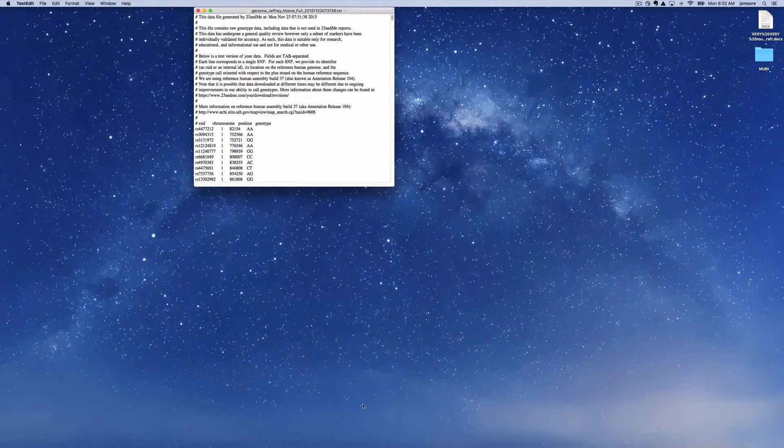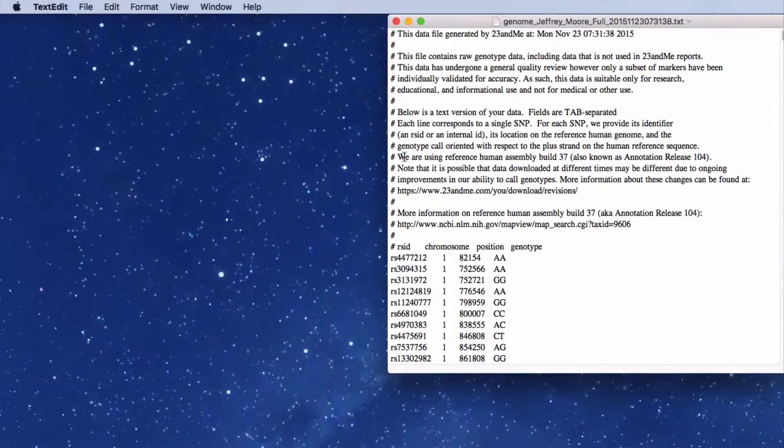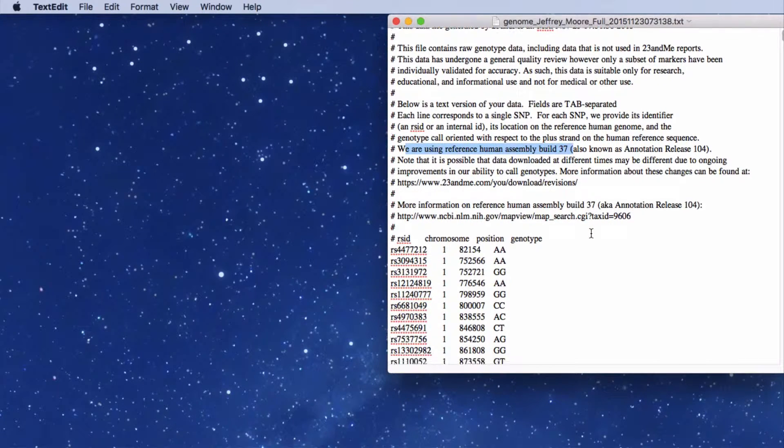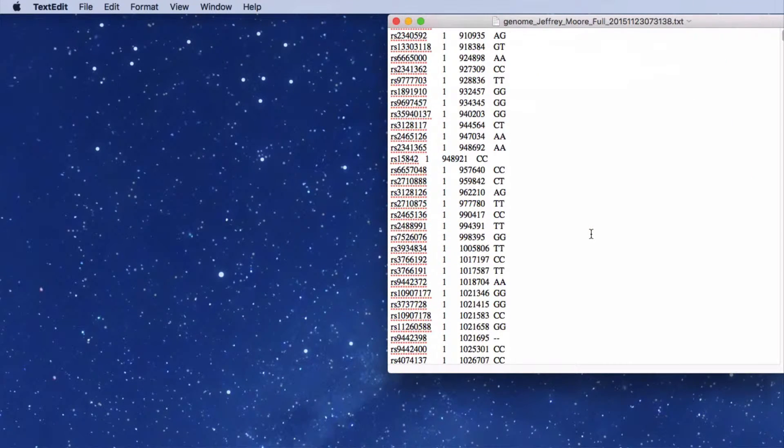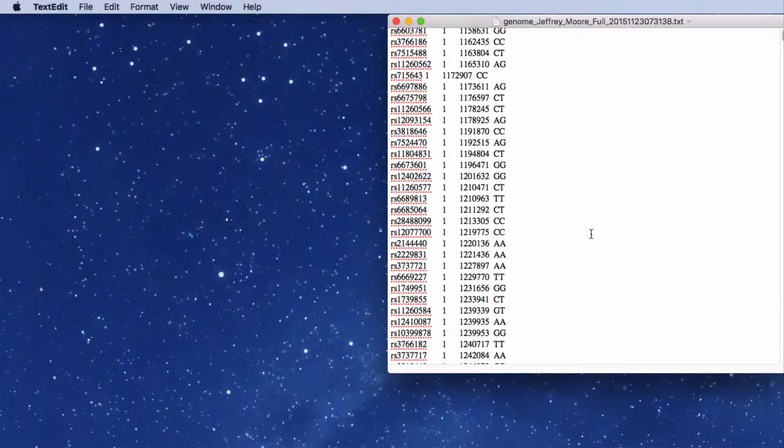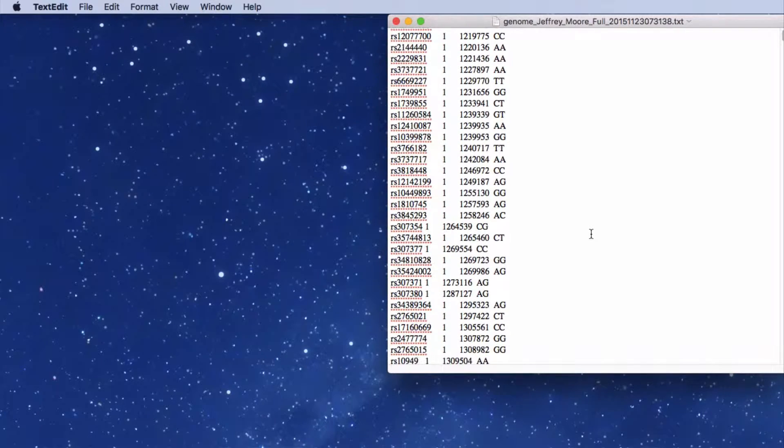A text file appears. Notice the data is referenced to assembly build 37. The file contains thousands of lines of data.